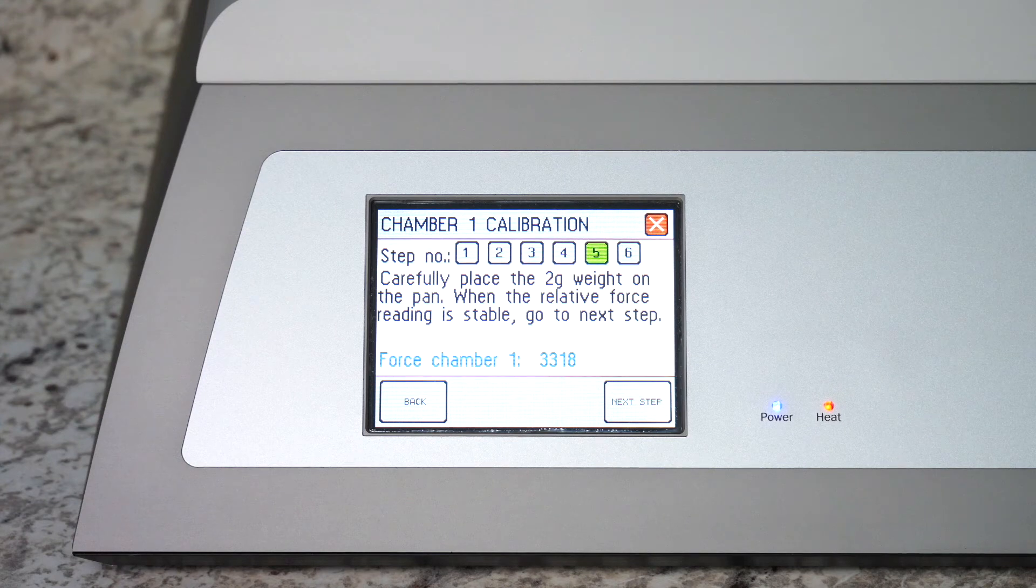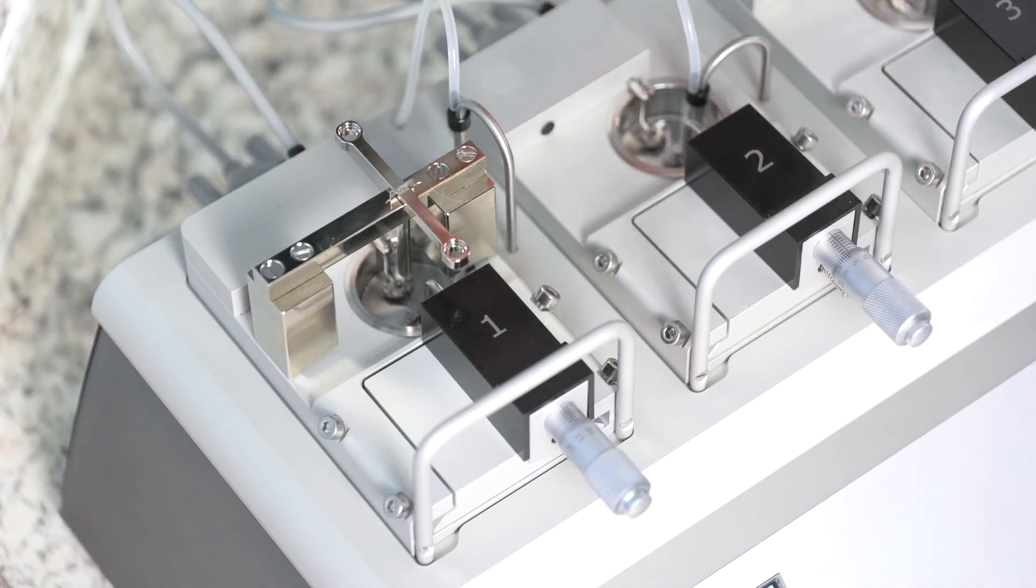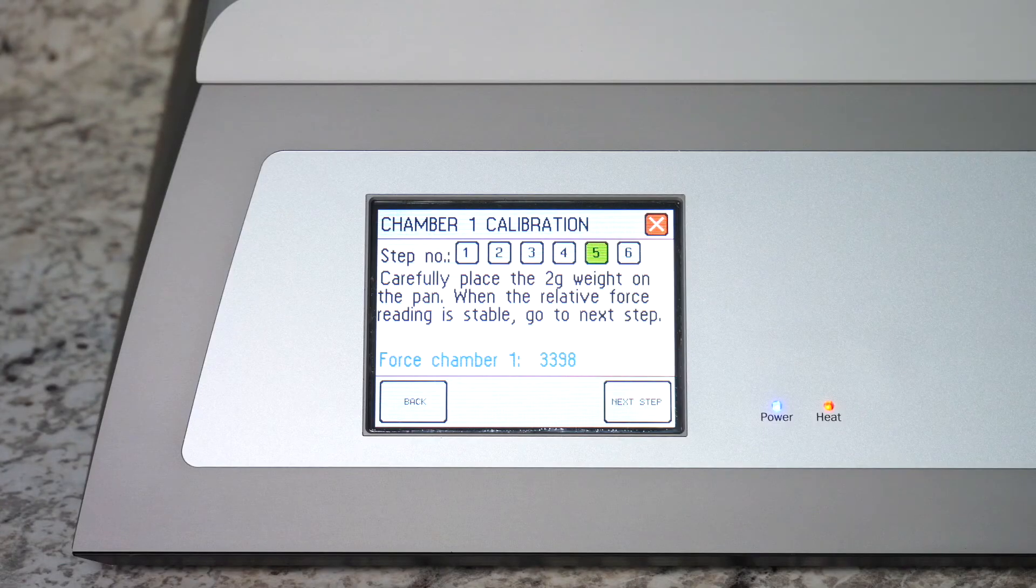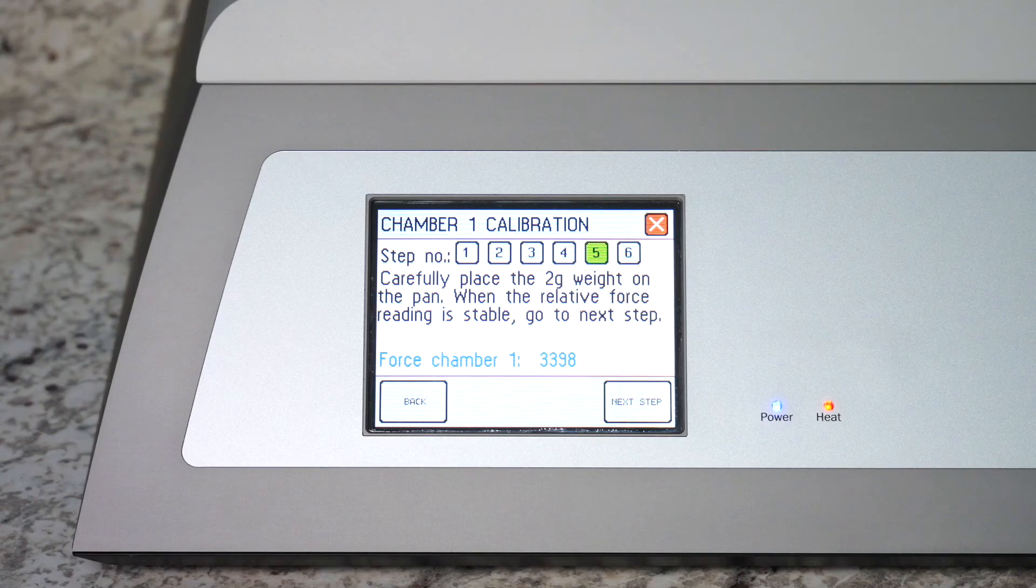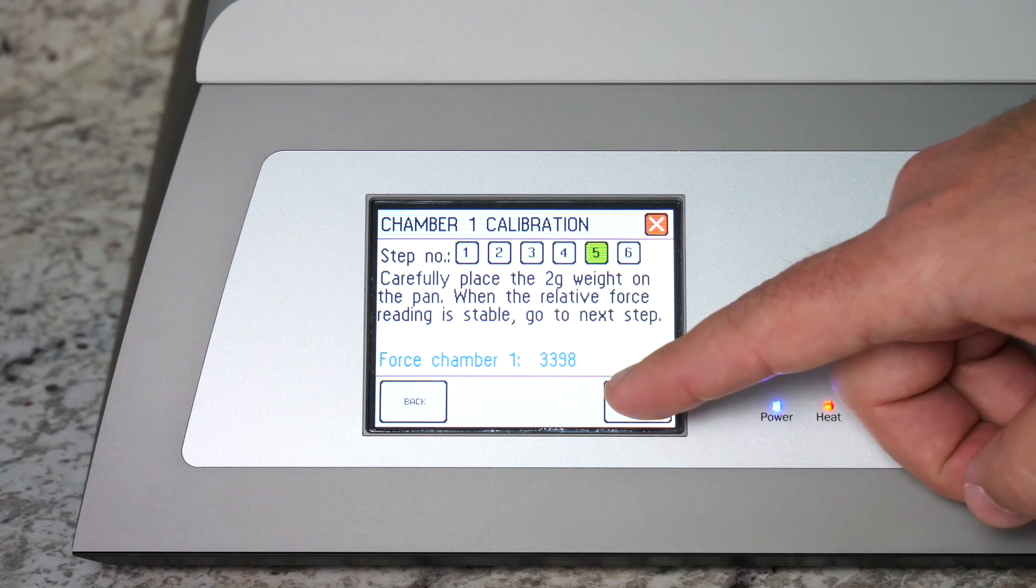Step five asks you to place the calibration weight on the pan. You will need to place the weight on the back pan to kick the bridge forward. After you add the weight give it about 10 or 15 seconds to stabilize, and then you can go to the next step.